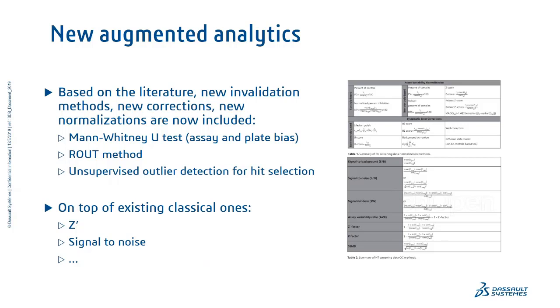But this report can be quite customized, so that you have directly in the report the places to look at, maybe manually, to have a human eye on some points that have been invalidated automatically, but that you might still want to have a look at.